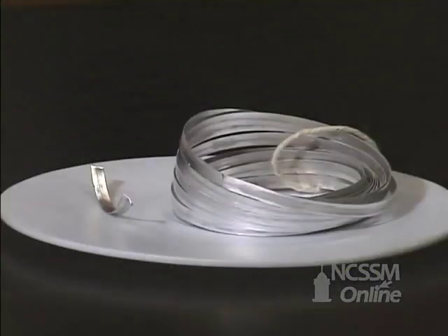If we go across a row on the periodic table from sodium to magnesium, the ionization energy increases and the reactivity of the metal decreases. One thing that's very apparent is the difference in how we store the metals. Magnesium is not stored under kerosene or mineral oil, it's stored out in the air. And even after being stored out in the air for months, the metal still has a very shiny surface.